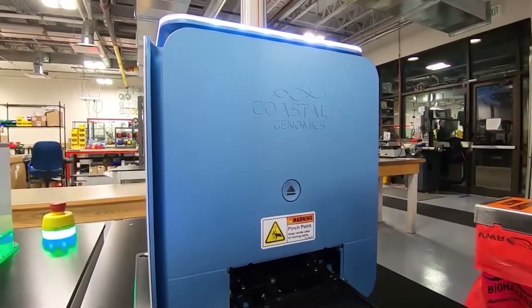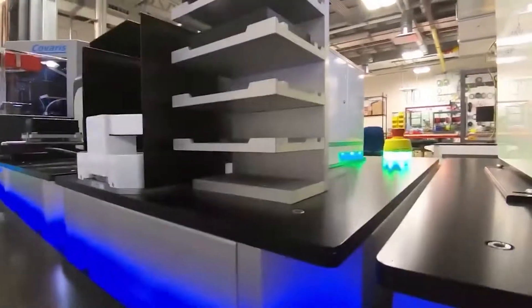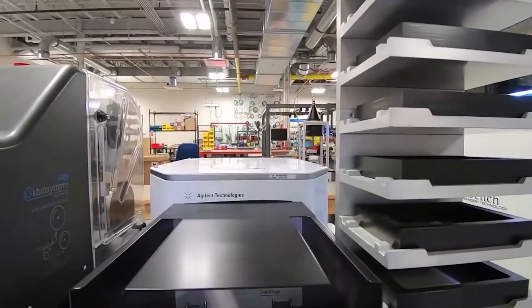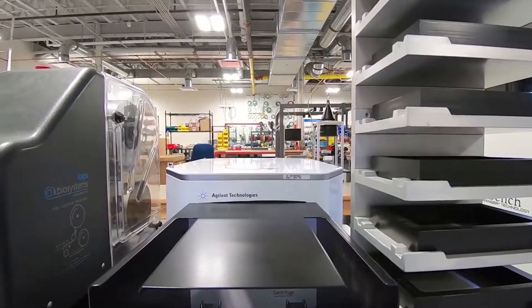We're on the clean side of the lab right now — all the pre-amplification sections. We have two Tecan 1080s; both of these do all the library prep and are really the workhorses of the system itself.